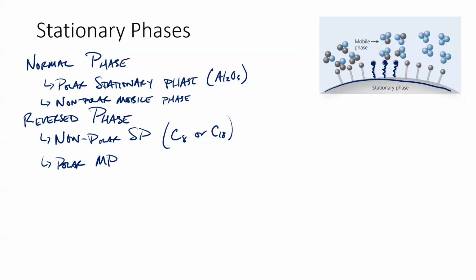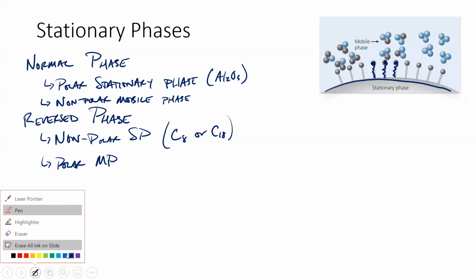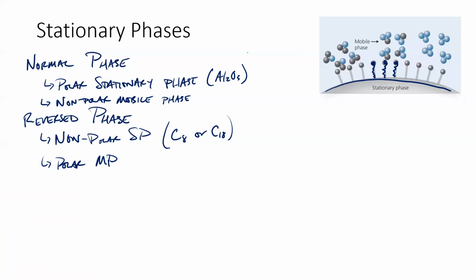Okay. And so for both of these, these are both driven by polarity. Okay.